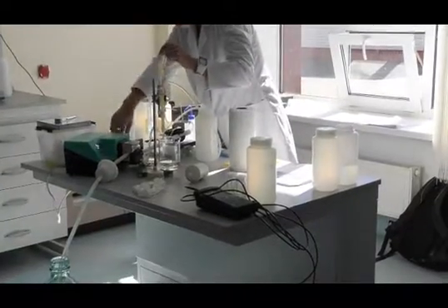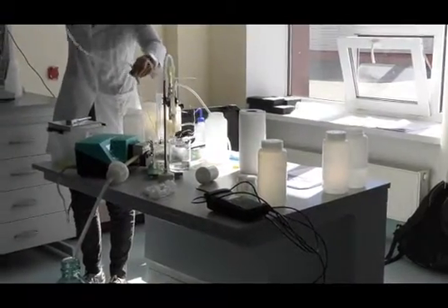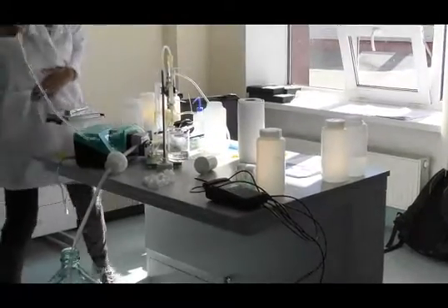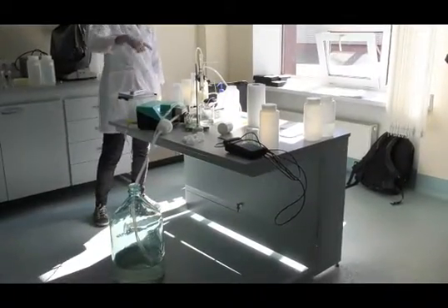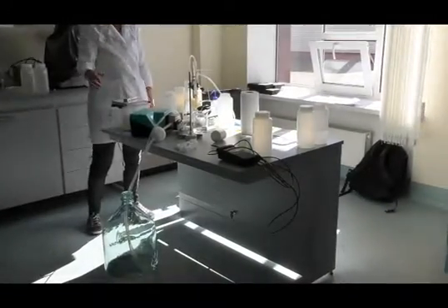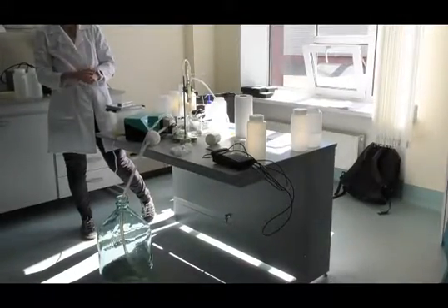So to make sure we don't use all the water, we put the sample back into the bottle and have a circle. We recirculate the sample, but that's okay if we have taken out all other samples from the bottle that we need. You need to take the total first.